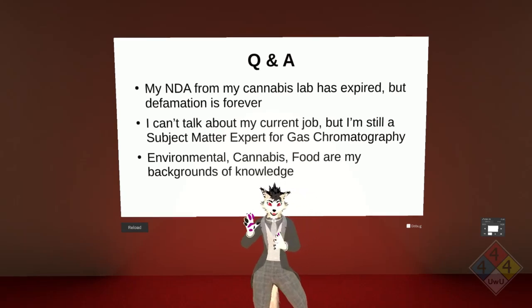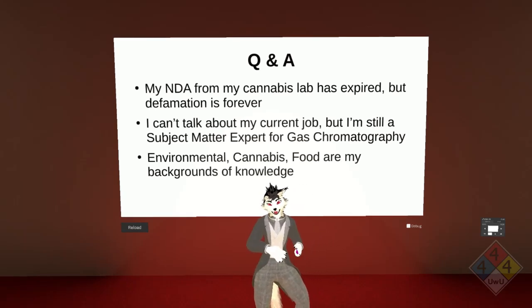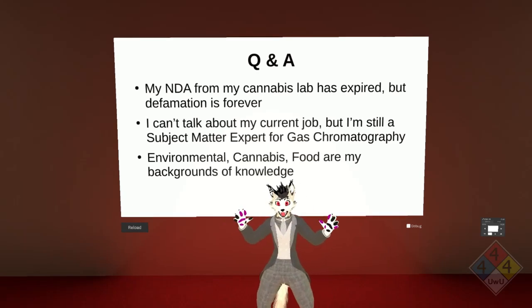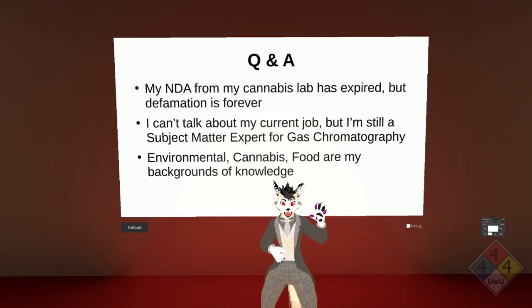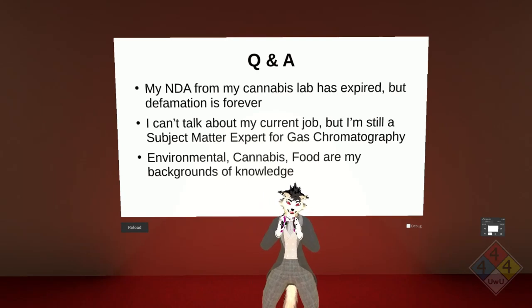Inversely, some of the things will not go into gas phase readily, so you cannot do, let's say, metal analysis on either an LC or a GC, so you need to bring in the ICP. One way to think of this is ionization, right? How strong are you trying to ionize something, bring a charge to the molecule?